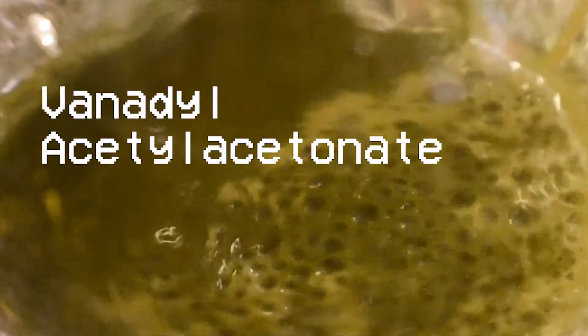Hello everyone, welcome back to another video. Today we are going to be making a complex called Vanadyl Acetylacetonate. Vanadyl Acetylacetonate contains vanadium in the plus 4 oxidation state. We will achieve this by reducing Vanadium 5 in the form of Vanadium Pentoxide using an acid.